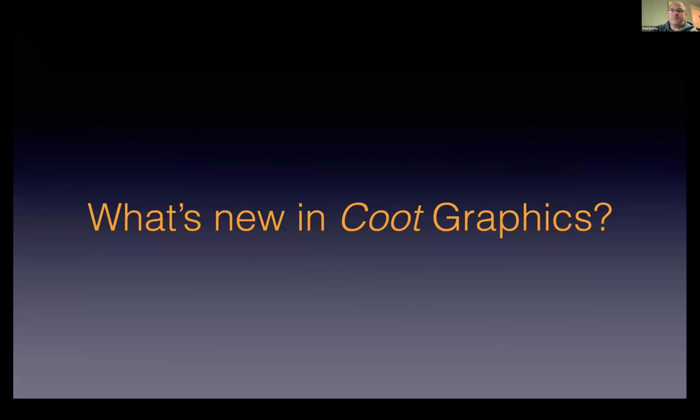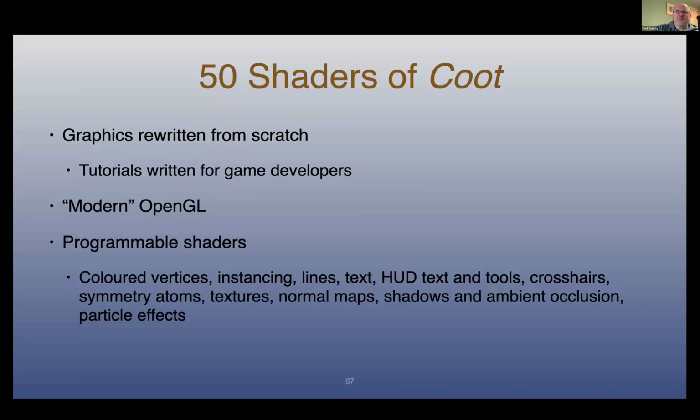And now I will spend a few seconds showing you what I call pretty pictures. As I said, my interest is mostly in the scientific developments of Coot, and graphics was not a priority. It has been more important to me recently, partly because it was forced on me, and I thought, well, seeing as I'm in the area, I might as well try to learn it.